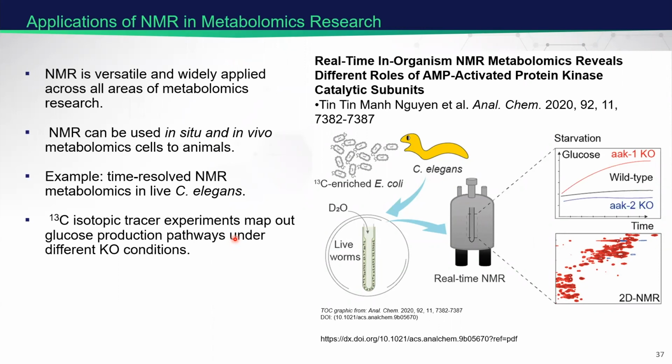So I wanted to just showcase some articles in metabolomics or omics research that have an NMR angle where NMR had a particular advantage to the study. And this first one that I'm showing here is just kind of showing the versatility of NMR.